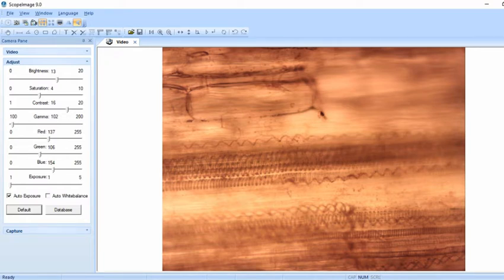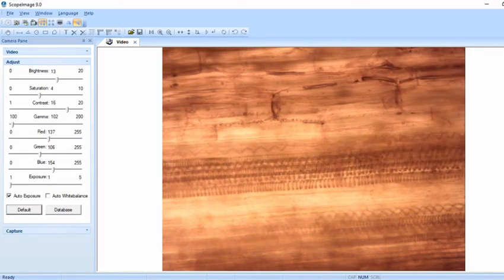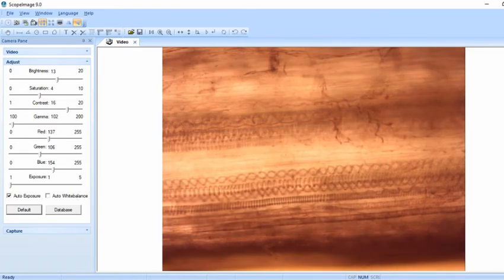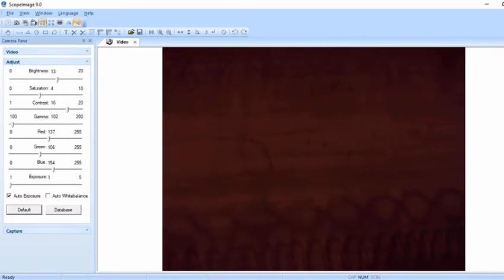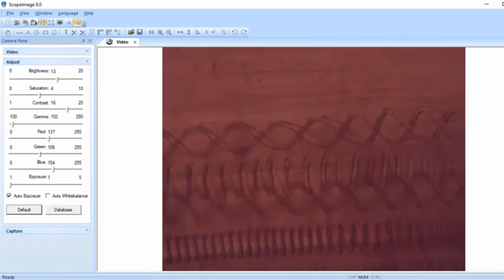Honestly, you never know what you're gonna find, and I wasn't expecting to find such interesting structures. I was just hoping to look for just xylem and phloem and just usual vascular tissue, but the fluid channels seem to be wrapped in these coils. Oh, look at that! It's kind of like a helix. What if I'm getting closer? Let's find out. Yeah, it's like they're tubes.